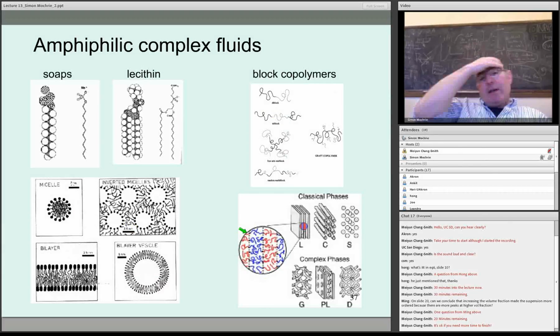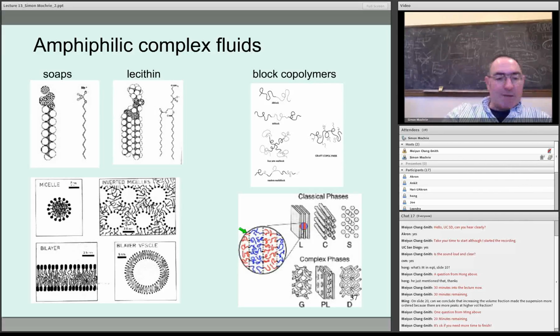Now, in the last few minutes, let me just mention that you can also apply X-ray photon correlation spectroscopy to polymer systems, which are much more weakly scattering than the colloidal systems that I've described to you. And so typically you have to collect a lot more data in terms of time, but you can nevertheless make measurements. So let me just show you the sorts of measurements that are possible.